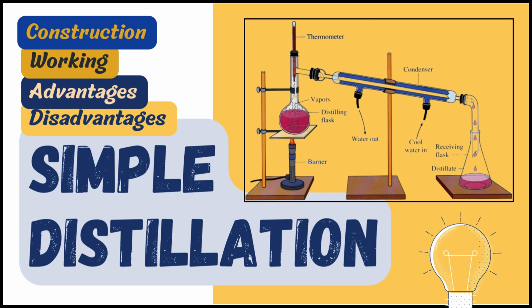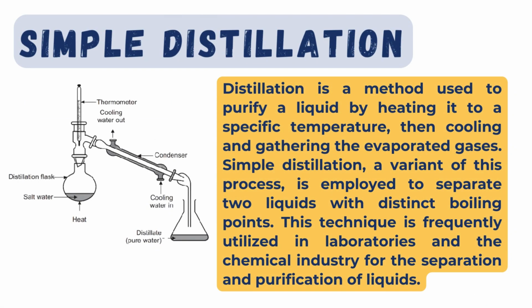Today we will be continuing with our series of videos on distillation. Particularly in this video we'll be discussing a type of distillation which is commonly used worldwide, that is simple distillation. We will be discussing what simple distillation is, its construction, its working, its advantages and disadvantages, and at the end we will be discussing the applications of simple distillation. So guys, let's get started with what is simple distillation.